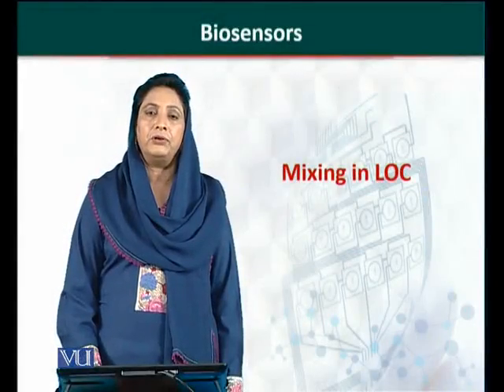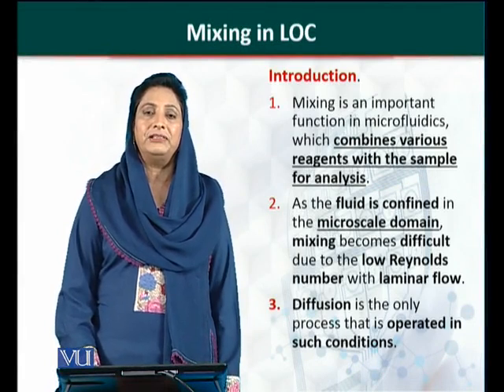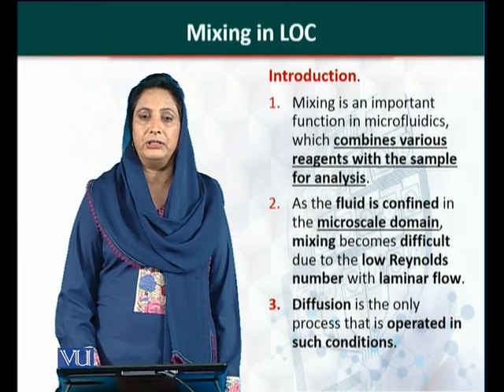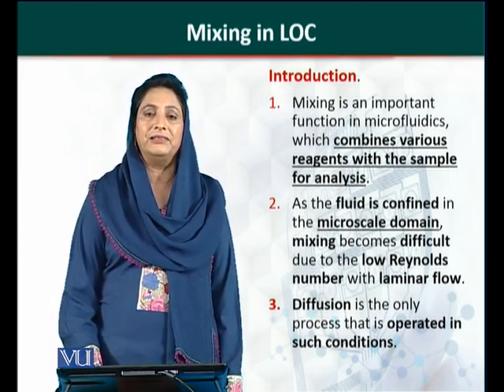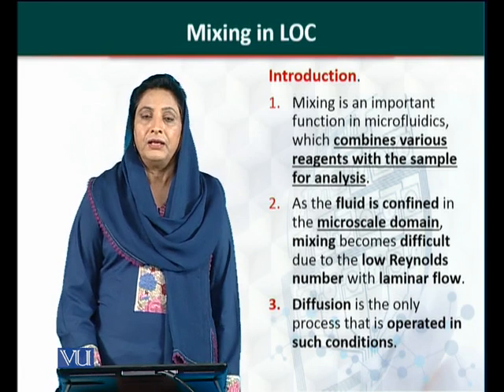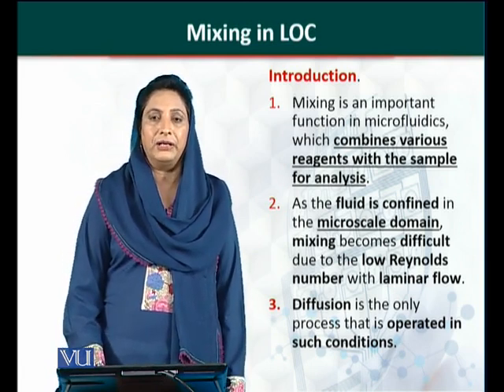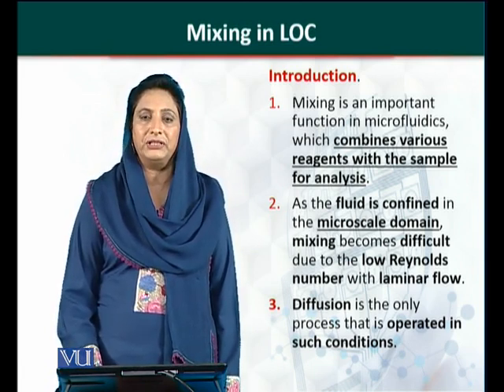Mixing in lab-on-chip technology. Mixing of sample with its reagent is an important element in lab-on-chip technology because for getting the results, we have to mix the sample with the reagents to get a positive or a negative result. We know that in a lab-on-chip, there are microchannels and the samples are confined to these microchannels.